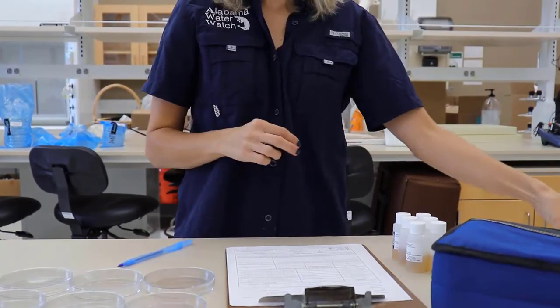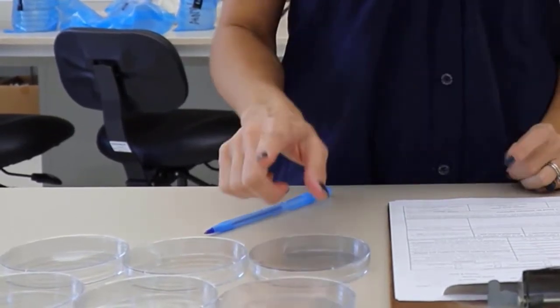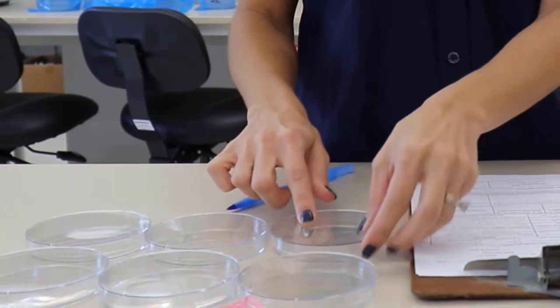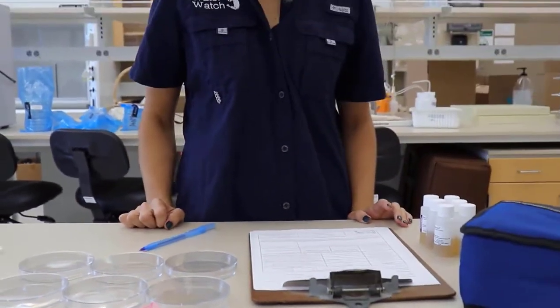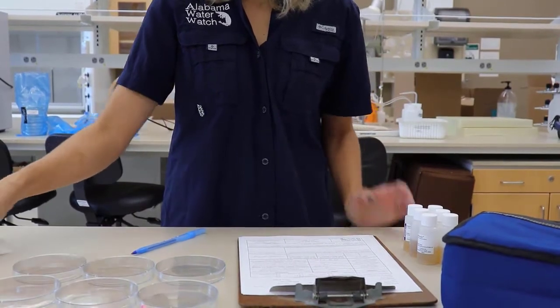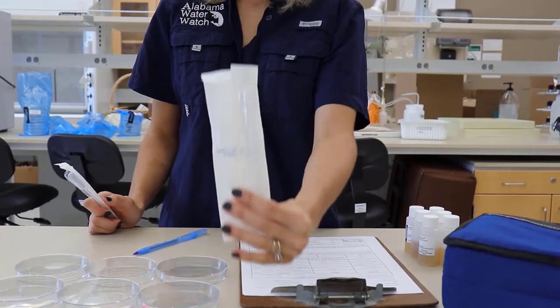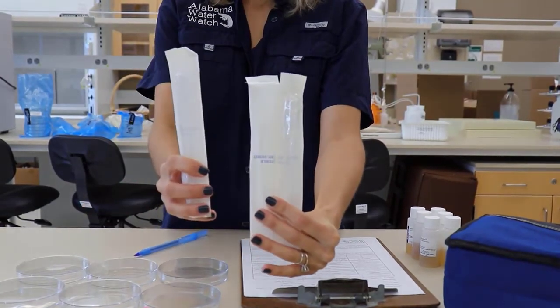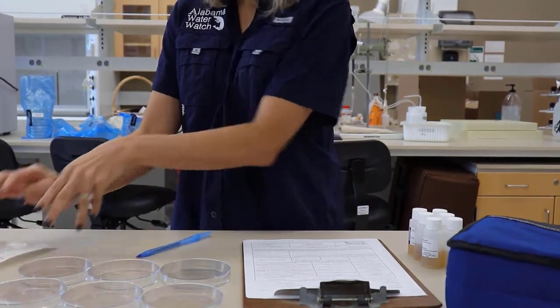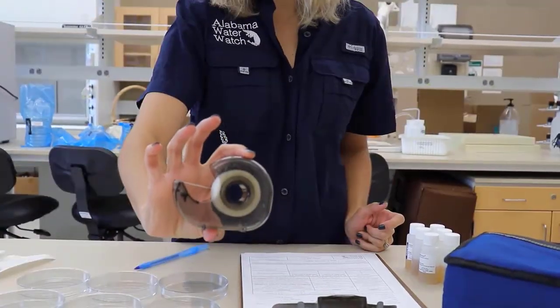You will also need 1 pre-treated Petri dish for each media bottle. So for this sampling event, we will need a total of 6 dishes. We also have our wrapped sterile pipettes ready, 1 per site, plus an extra just in case one of the pipettes is lost or contaminated. For instance, if you drop one onto the ground while sampling. To prepare your Petri dishes for the field, you'll need a permanent marker and clear tape.